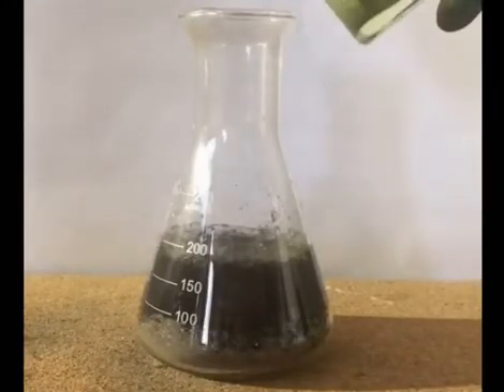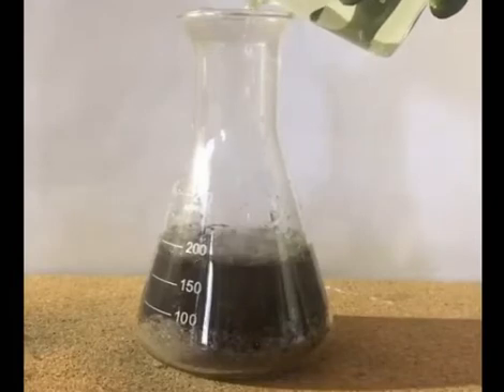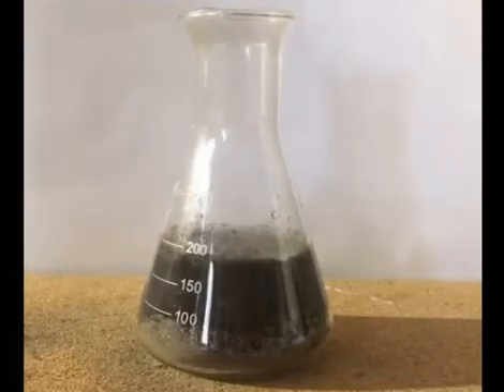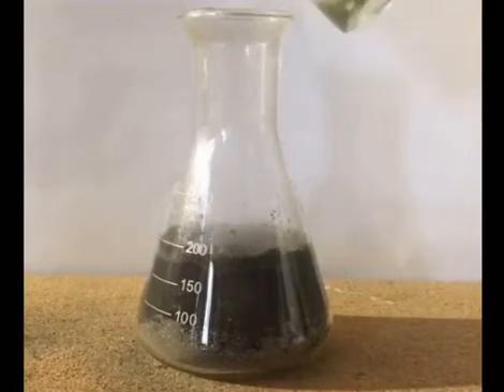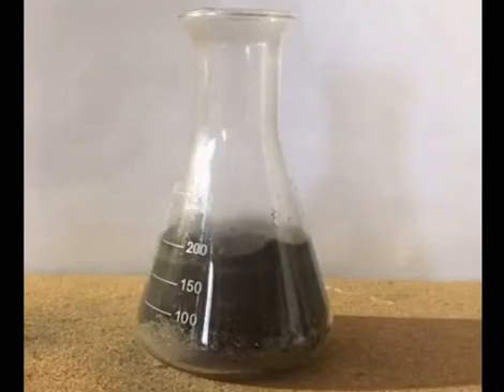Finally, the reaction mixture is heated to 80°C for about an hour to make sure the reaction is completed. At this point the pH is around 5.